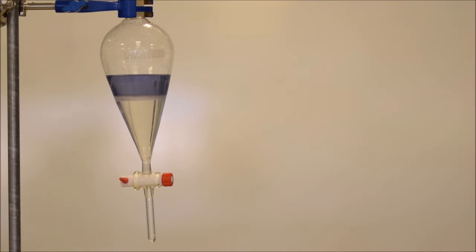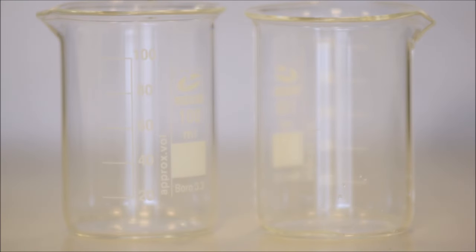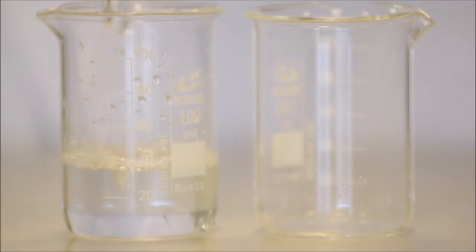Once it has separated though, there's an issue that we're never actually going to get all of the water out of the organic layer. So we have to do something to help ourselves with that. And what we can do is, once we've decided we're not going to wait anymore, we do our separation and we put our organic layer, top layer out the top, bottom layer out the bottom. But we take this layer and we're going to use something to dry it.